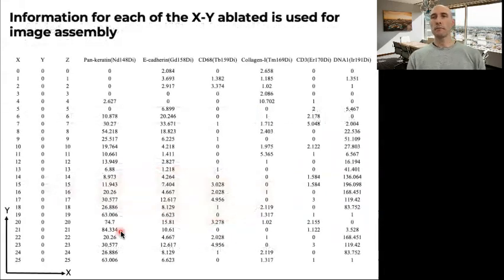This is something important to remember as we enter the last part of the data analysis, and things start getting interesting here. So once the ions are measured, the way the software reassembles the image is by remembering what was in each of the 1 micron samples that the Hyperion sent to the detector. So the way to record this information is, for each of the channels, as you can see here, you have values for each of the markers, but these values are recorded in a determined XY position.